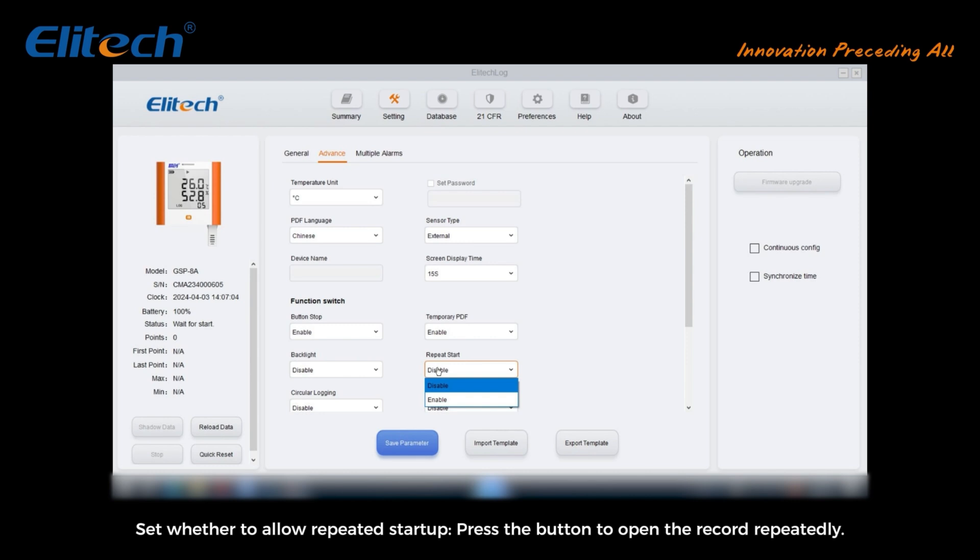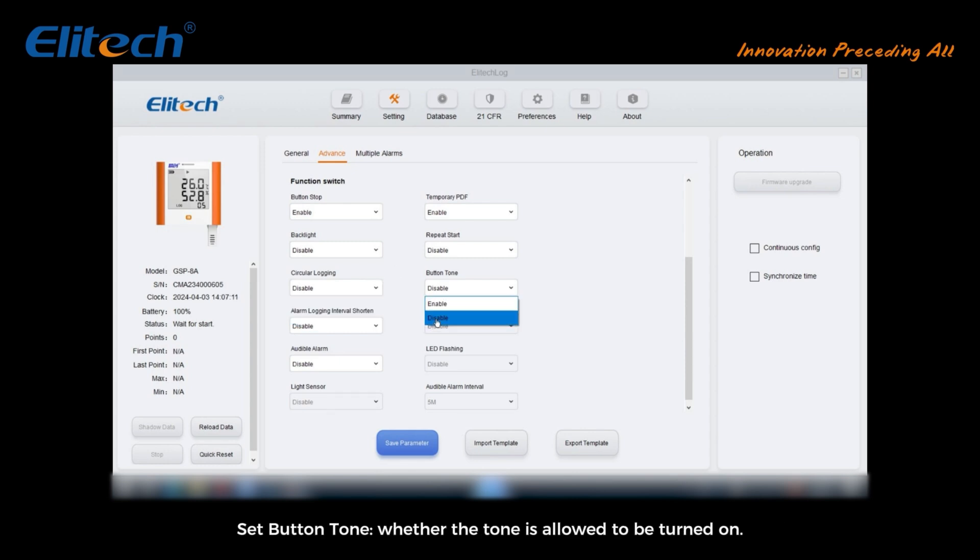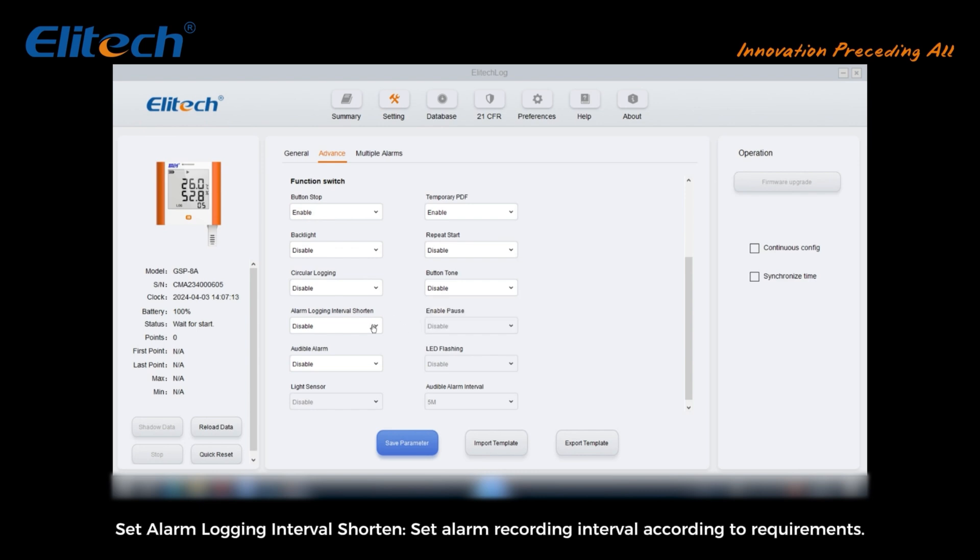Set whether to allow circular logging: when data is full, new data overwrites old data. Set button tone: whether the tone is allowed to be turned on. Set alarm logging interval: shorten alarm recording interval according to requirements.